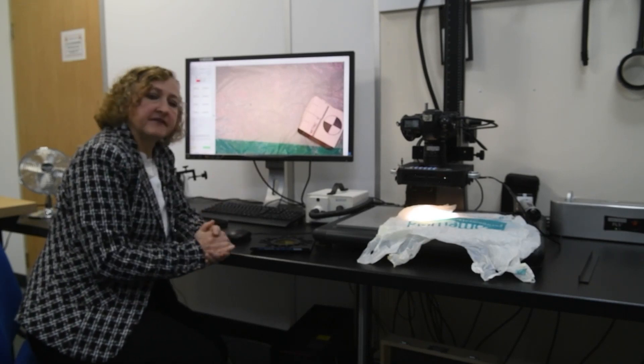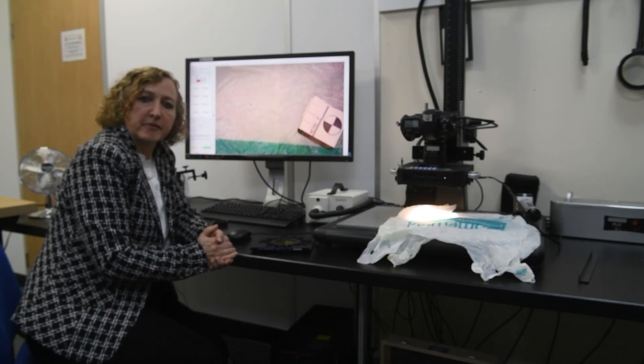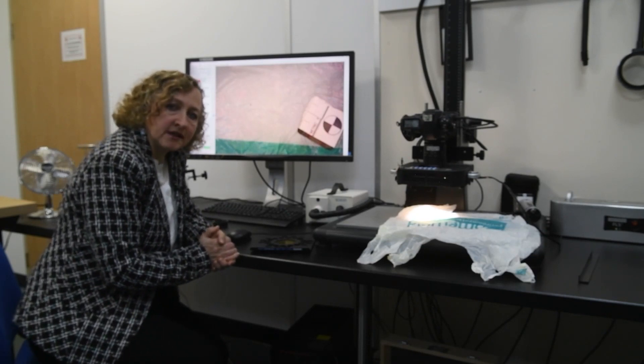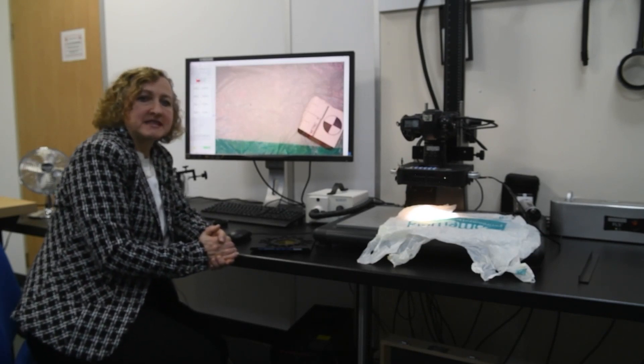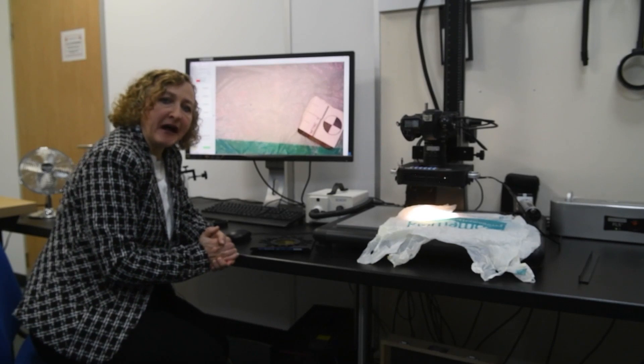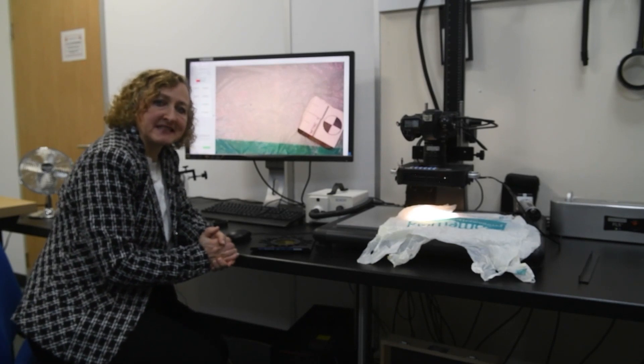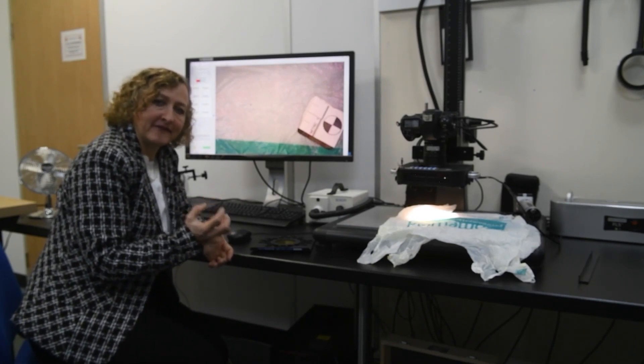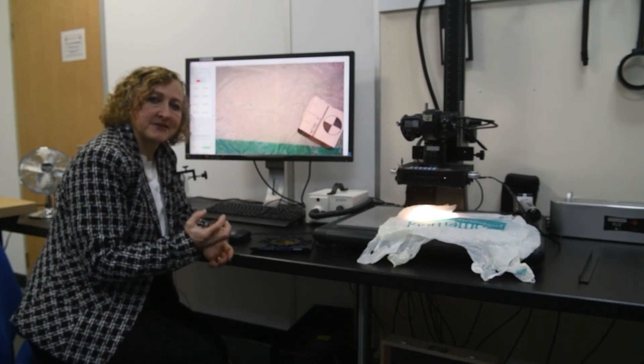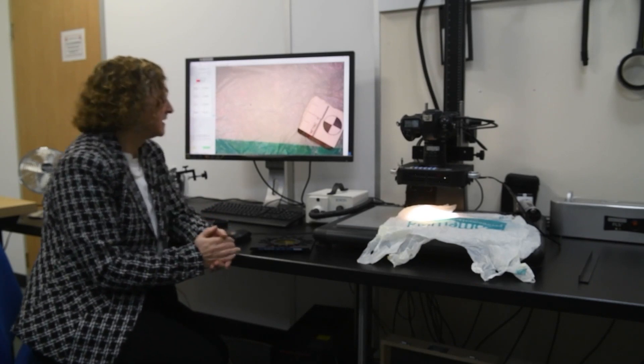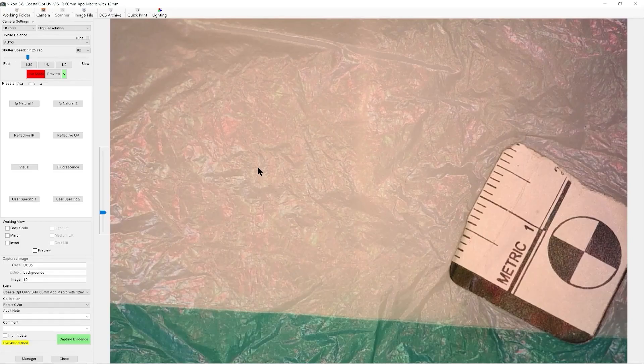But the samples that I have here today are about 15 years old. So they were treated a very long time ago, and the fluorescence is extremely faint compared to when it was originally treated.